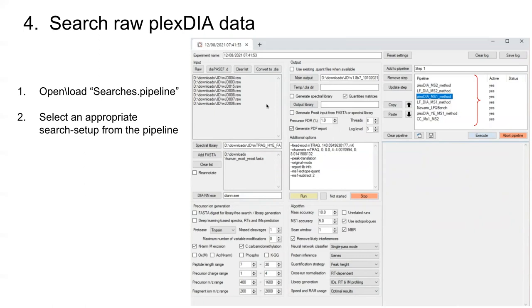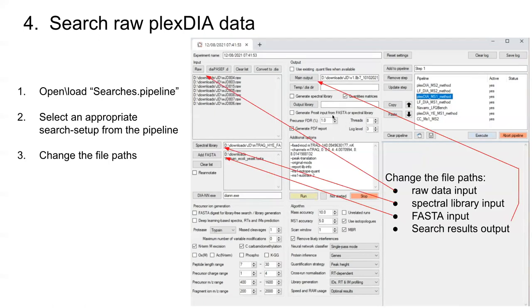Using that as an example, the next thing you'll want to do is change the file paths. Change the main output. We don't have to do anything with the output library because we already generated one. Then we'll read in the spectral library that we just made, add in the FASTA again that we wish to use, and change the raw file paths as well.